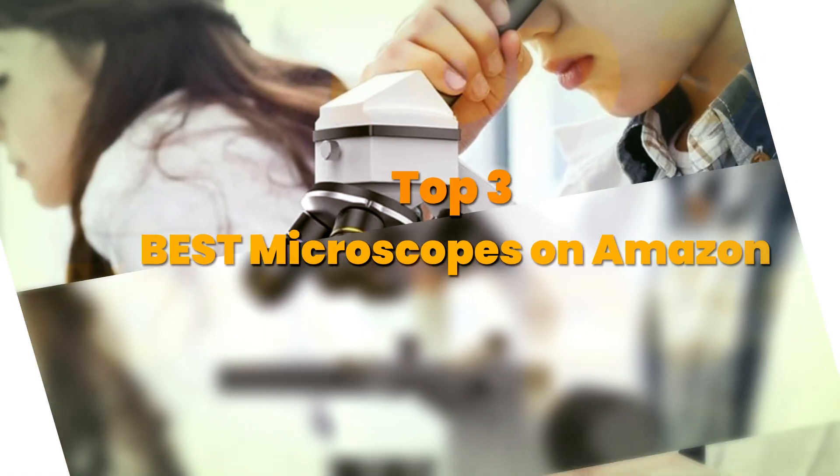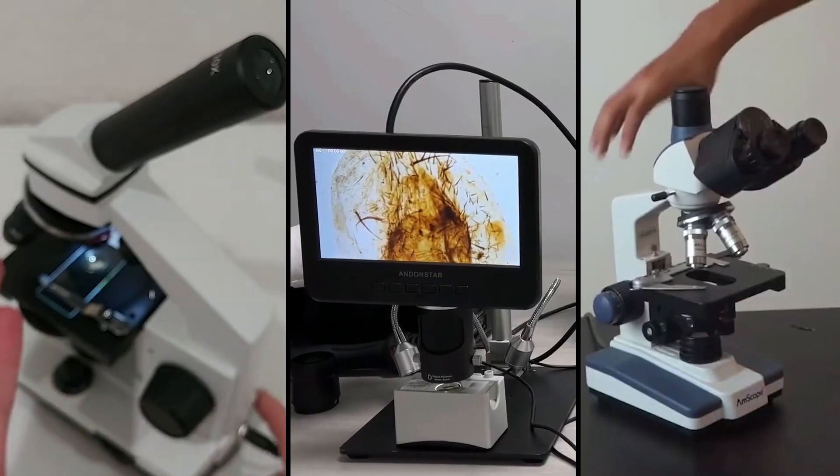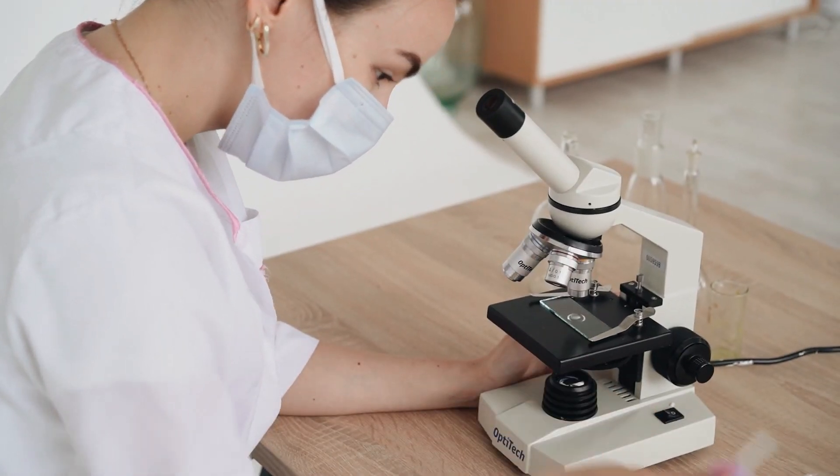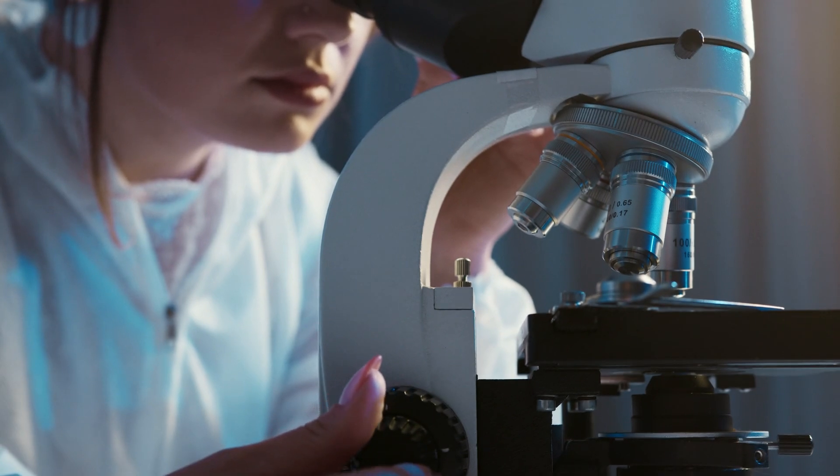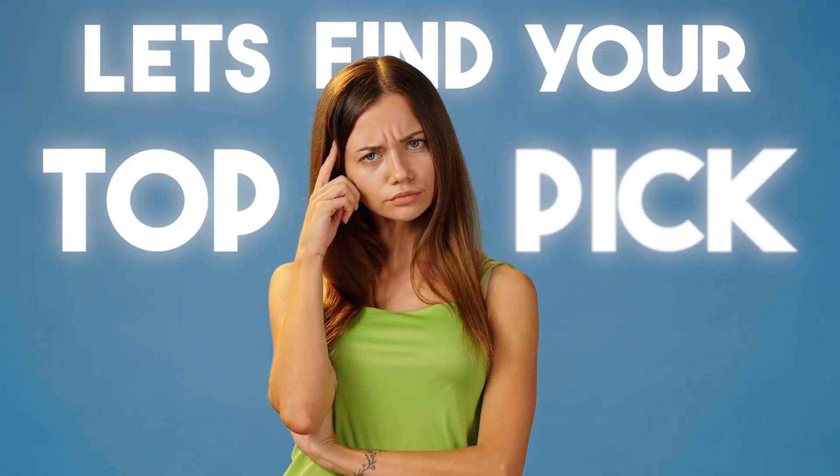Today's video is on the top three best microscopes on Amazon. Through extensive research and testing, I have put together a list of options that meet the needs of different types of buyers. So whether it's price, performance, or use, we've got you covered. For more product information, I have included affiliate links below, updated for the best prices. Now, let's find your top pick.